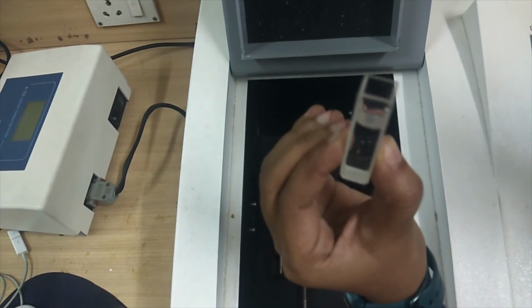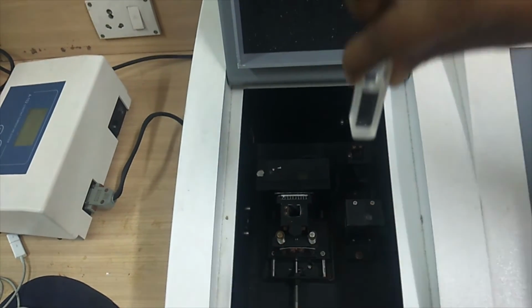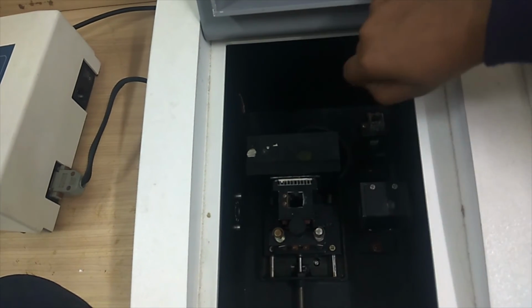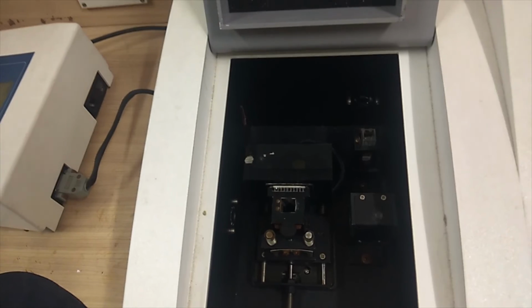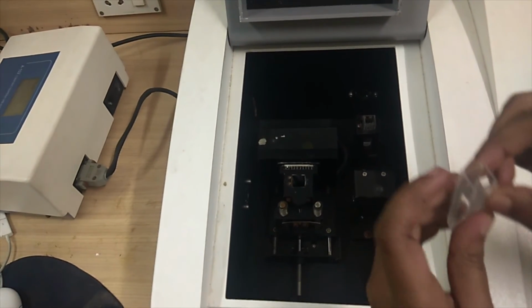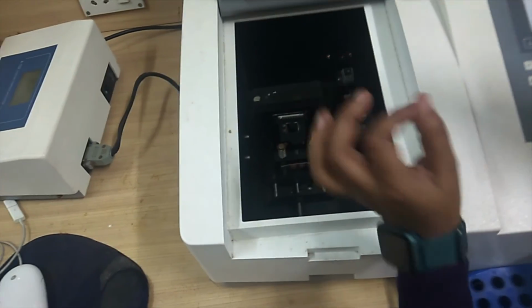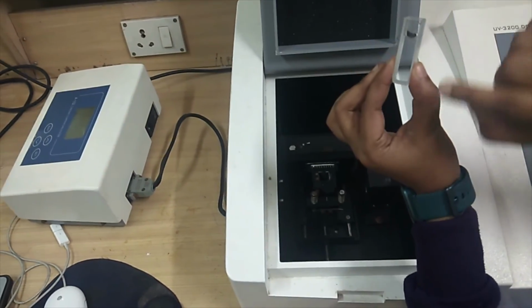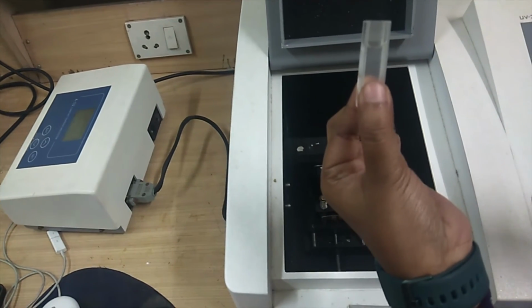We want the light to pass through it, so we'll keep the transparent surface in this direction because the light is entering from this direction. Similarly, the second cuvette, which will later become the sample cuvette, will be placed, and this cuvette also has a transparent surface and a little opaque surface.